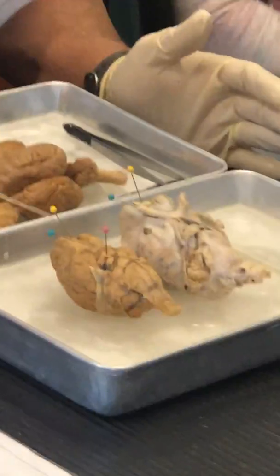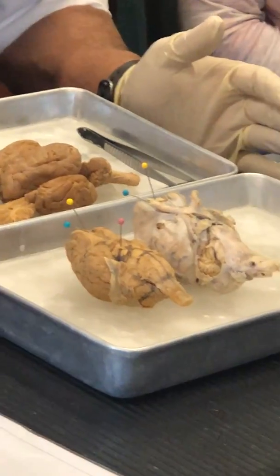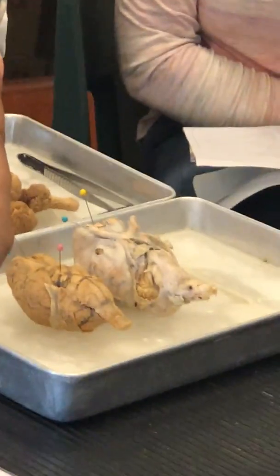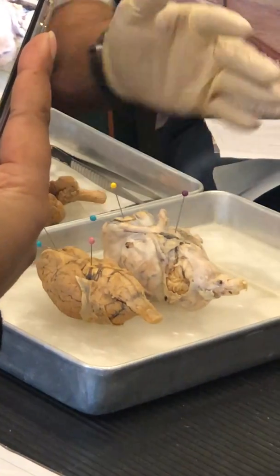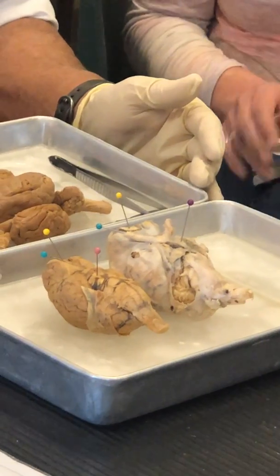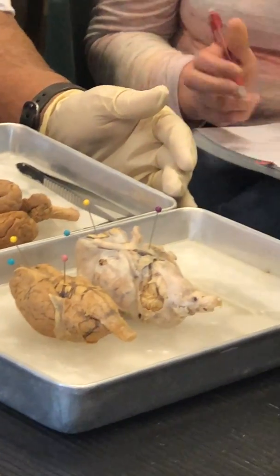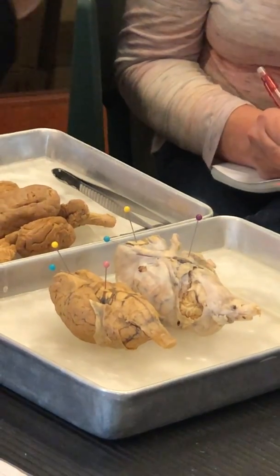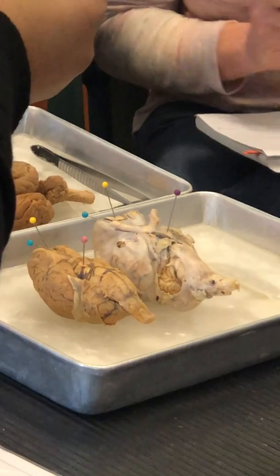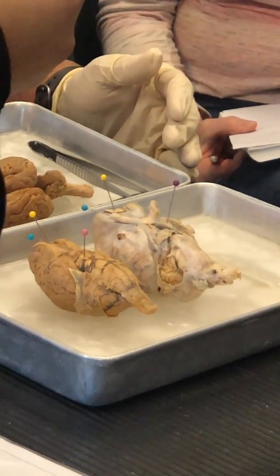So olfactory, optic, oculomotor. Alright? Now, what is that structure right in the mid-sagittal plane? That structure in the mid-sagittal plane right there is the pituitary gland. Pituitary gland. Pituitary gland on the dura mater sheep brain. It is absent on that. So you need to make sure you catch that. Yeah?